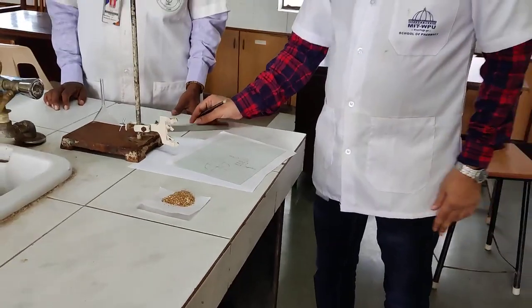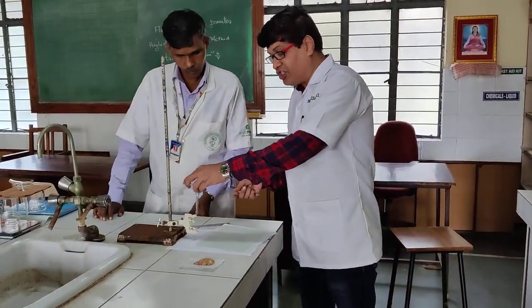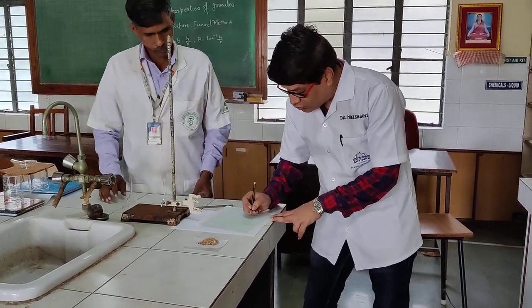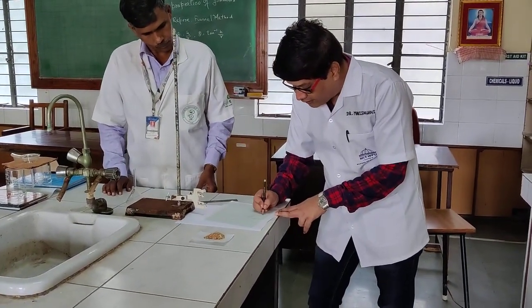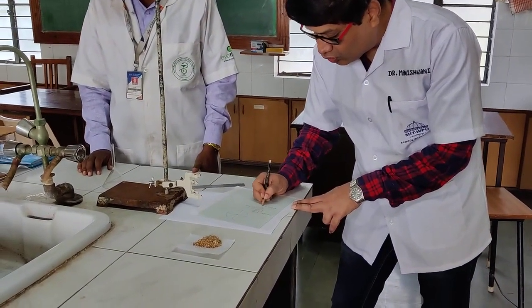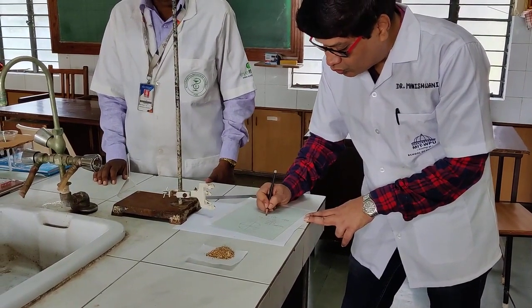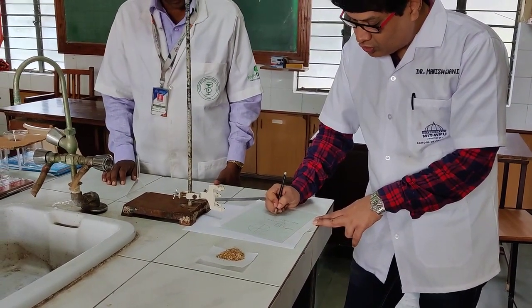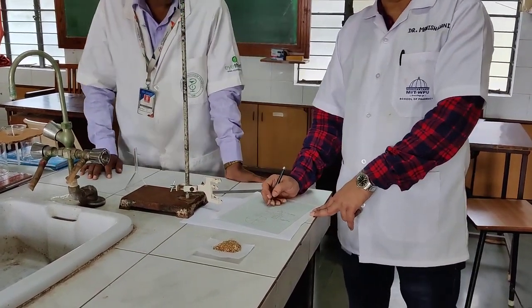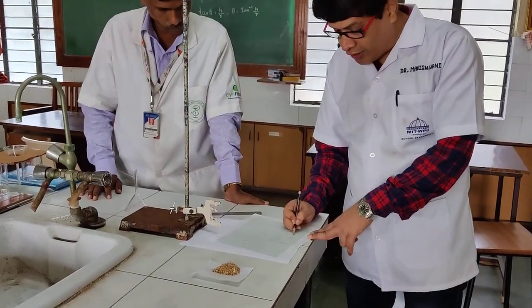After that, I know the height of this. I have arranged it 2 centimeter above. So the height becomes 2 centimeter, and this becomes your diameter. So your radius is equal to 6.53 divided by 2, which comes to 3.265 centimeter. That becomes your radius. Height we already know.